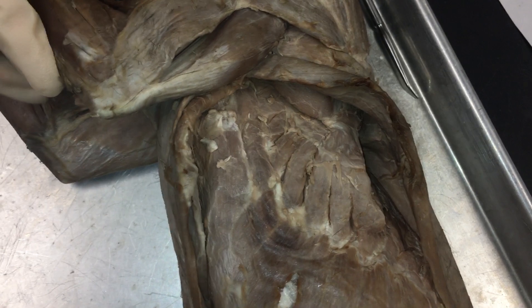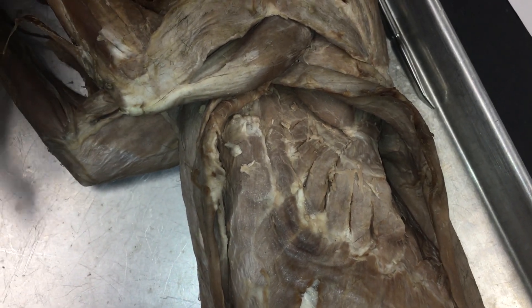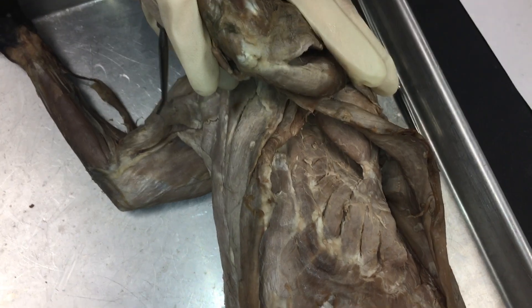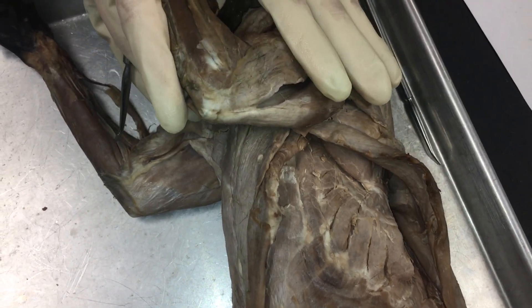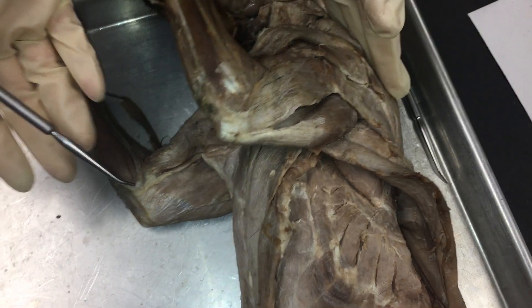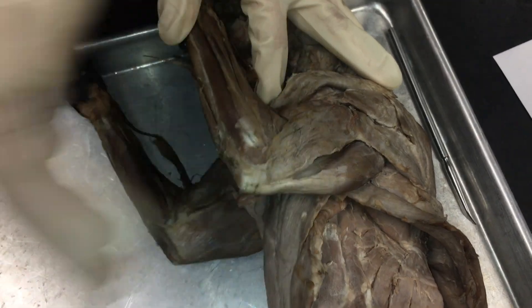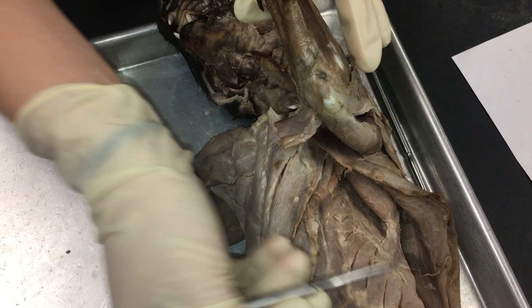What's left on your sheet is coracobrachialis and the scalenes. Coracobrachialis is only seen if you take the arm off, so we're not going to go over that. And scalenes — we will come up with a follow-up video for the scalenes, as they're not dissected out on this cat, and we want to make sure we cover all our bases.